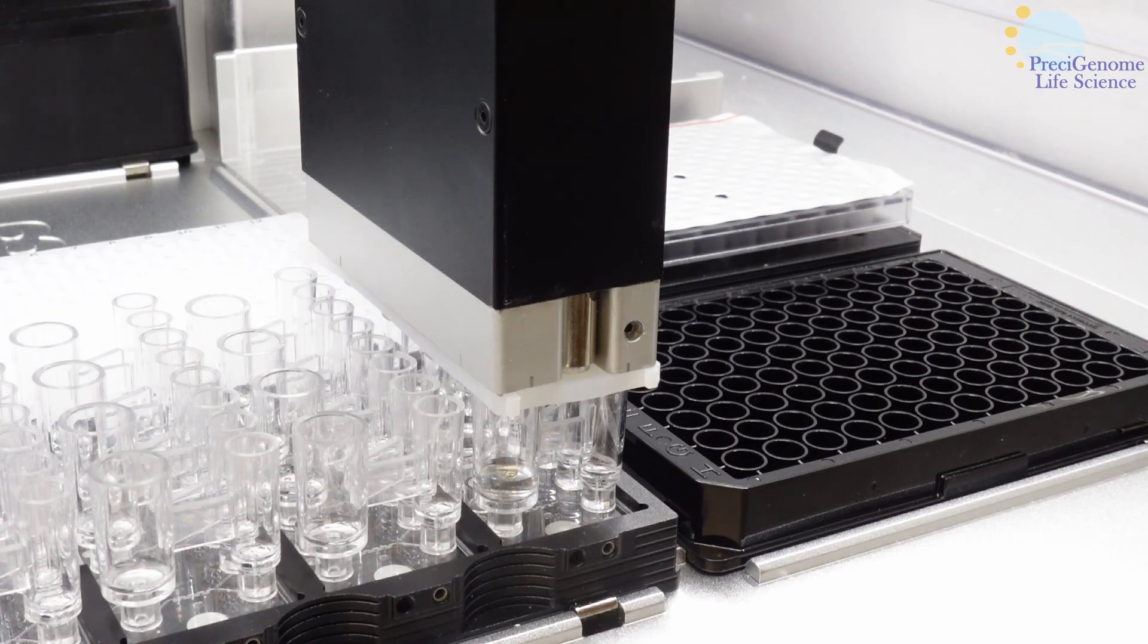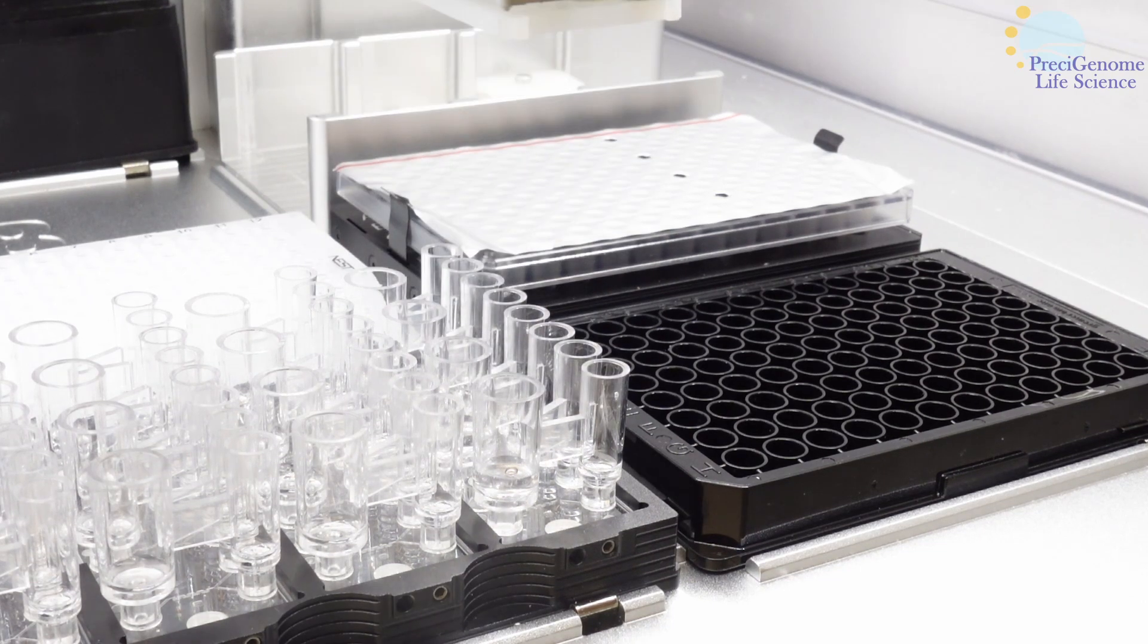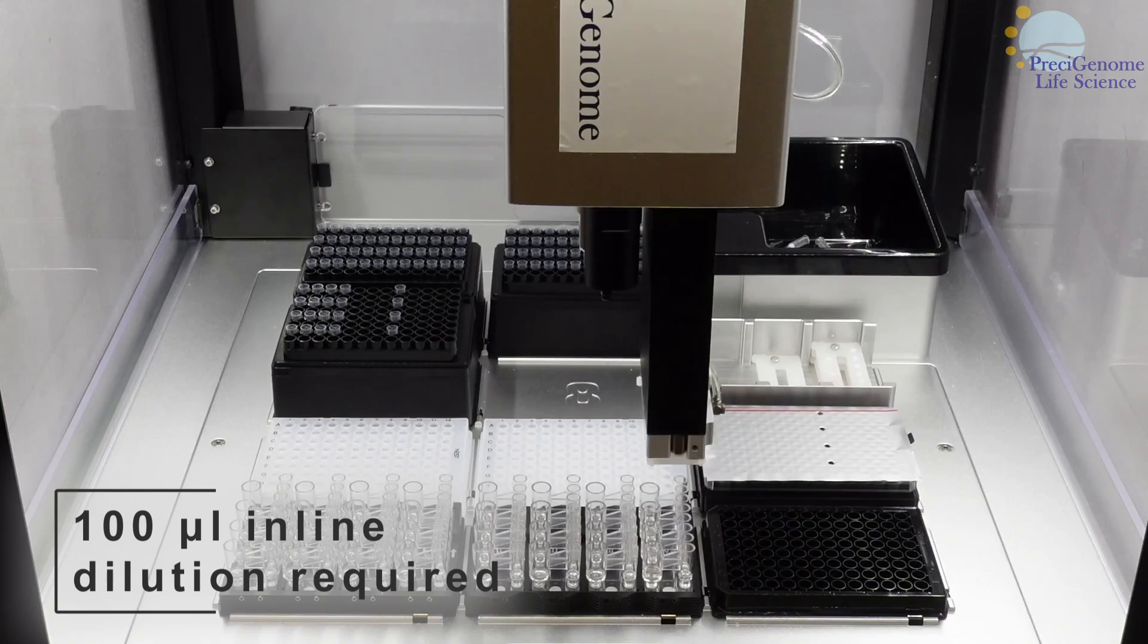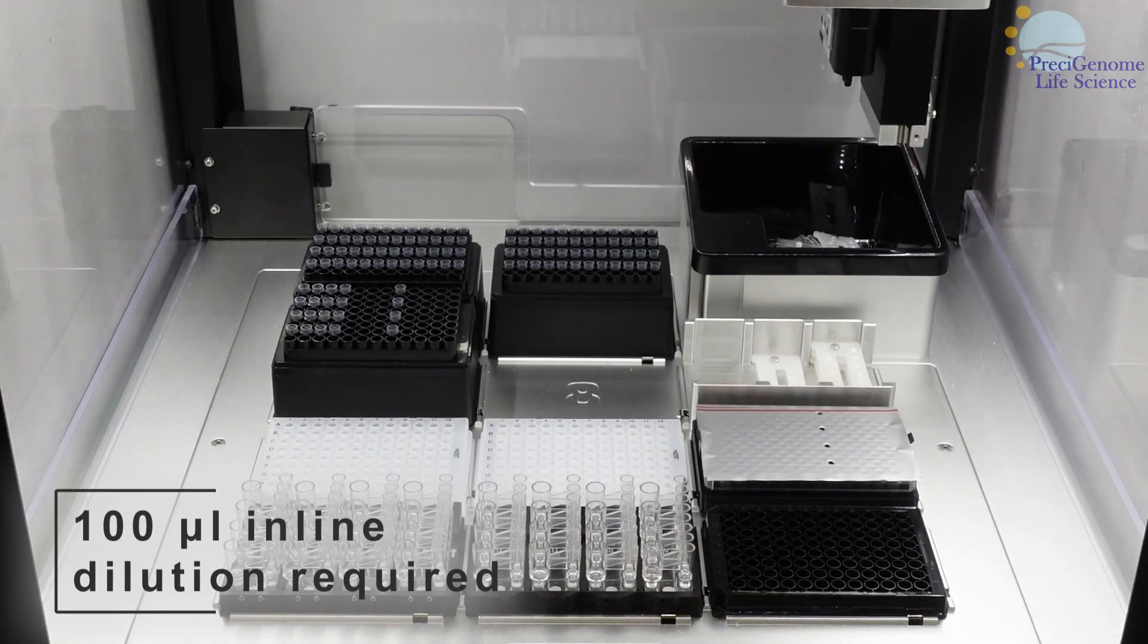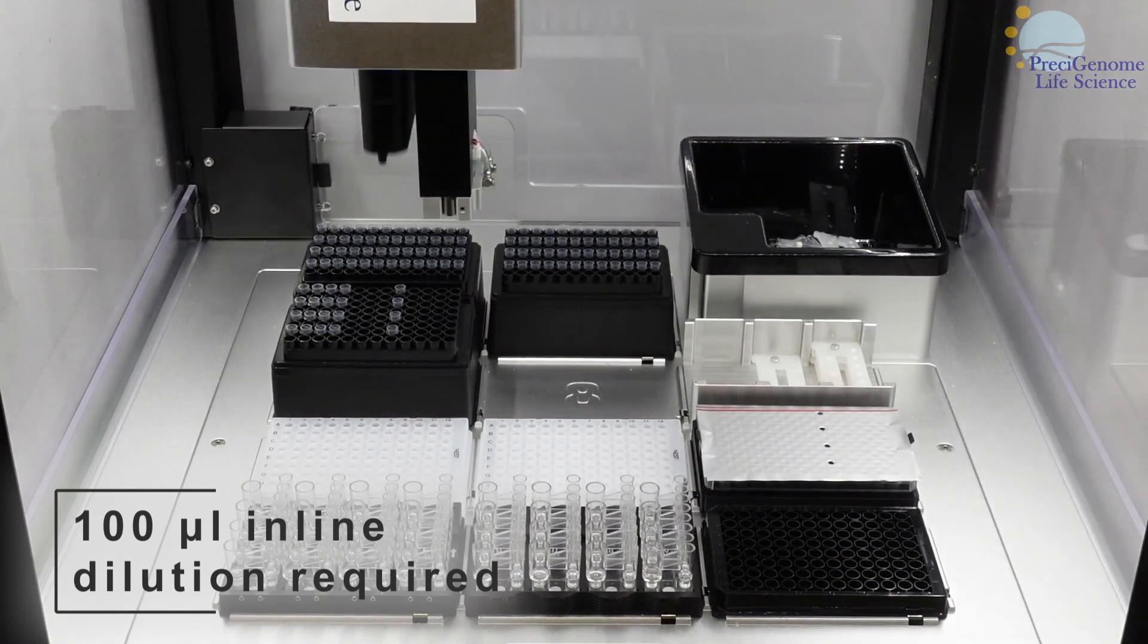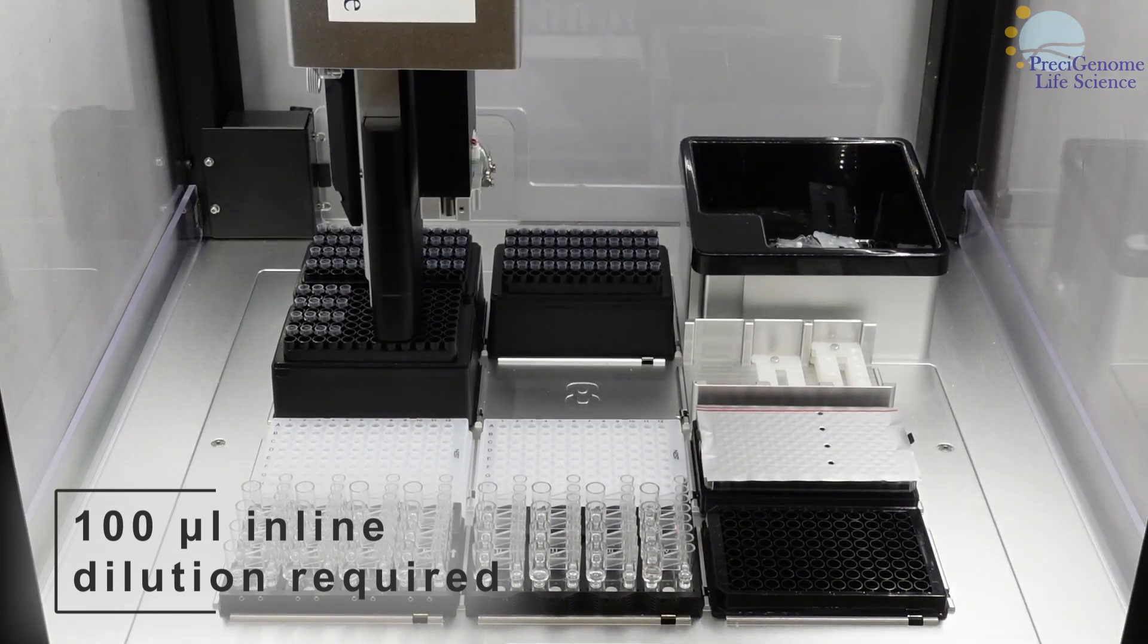Product will always be combined with a 100 µL inline dilution loaded at the start. This improves product stability and will be factored into collection.